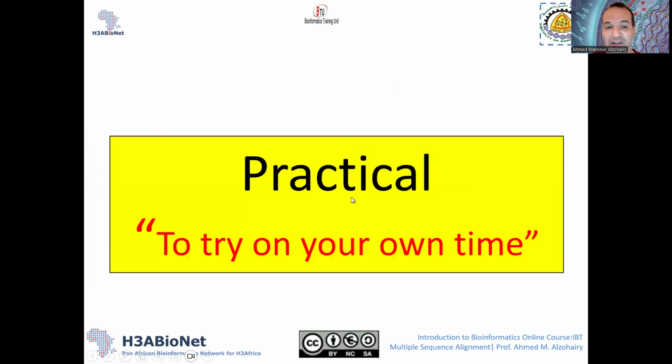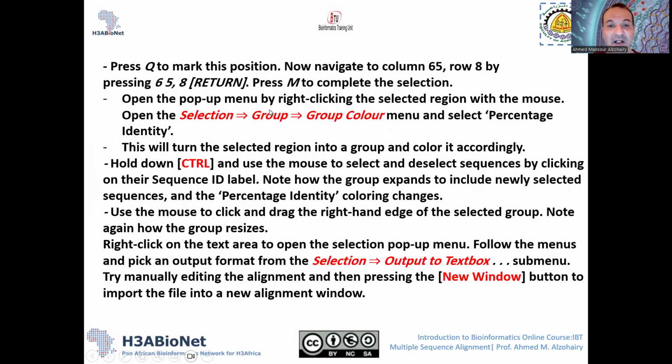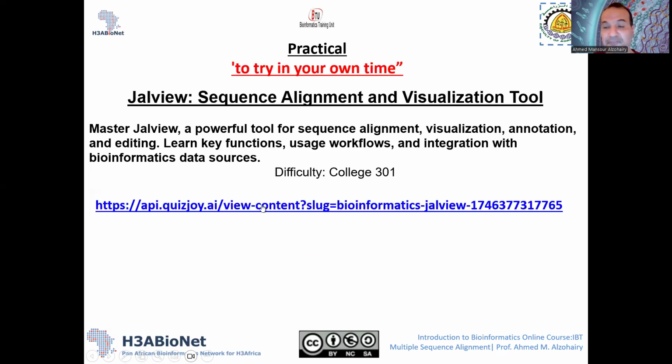Okay. This is only practical. You can just go ahead and do some practice here, or go to these multiple choice questions. You can just open this link, and of course you can answer the questions to practice with the content of that lecture.